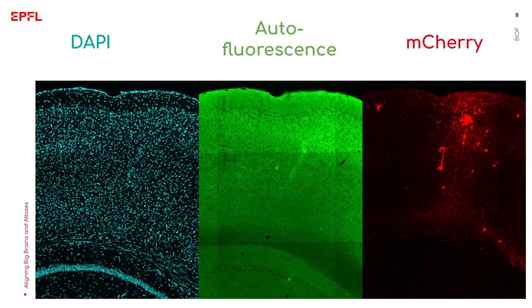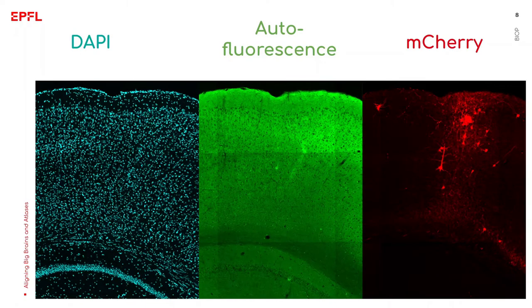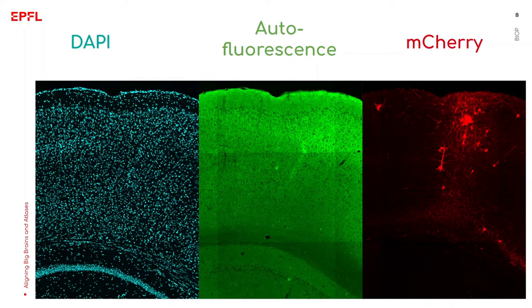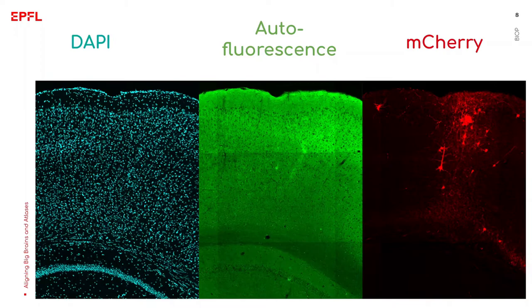Each section has 3 fluorescent channels. The first channel is a DAPI channel, a stain for nuclei. The second channel is autofluorescence and the third channel consists of sparse cells expressing a fluorescent marker. These are the cells of interest that I will locate in 3D within the Atlas by the end of the video.